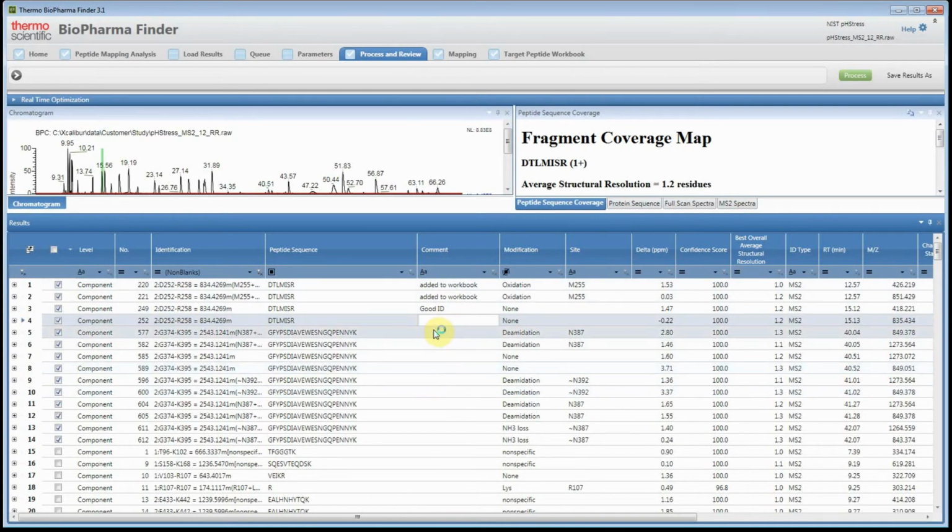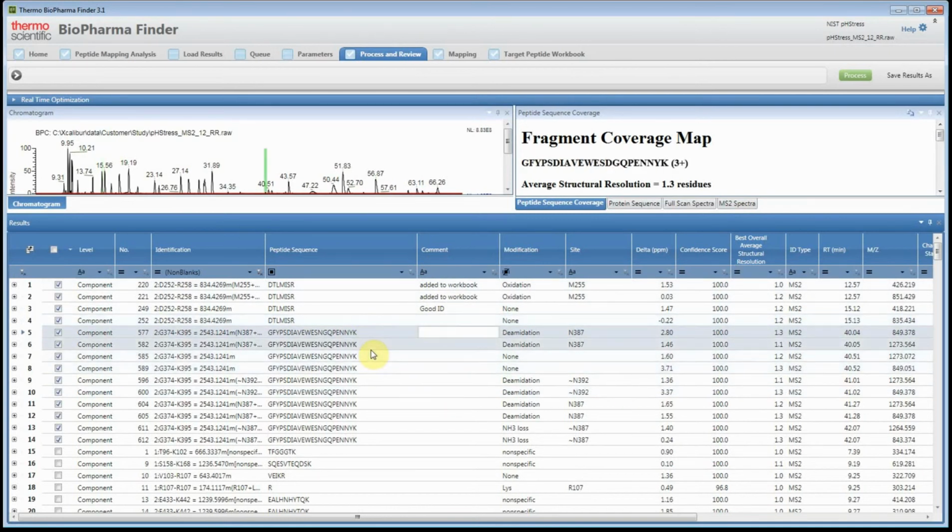And it's also going to put the same information into the modification summary where we just were. In the component table at the bottom, there's the comment column there as well. It's reproduced. Now you can save these results as a different name, but again, it automatically saves the comment information. So the comment column is very powerful.